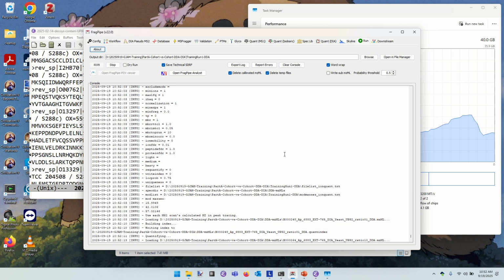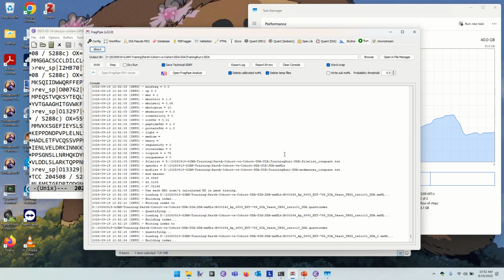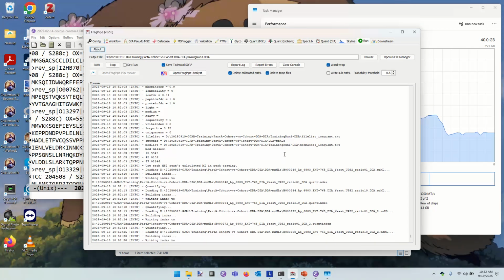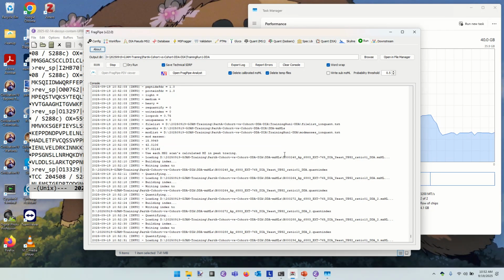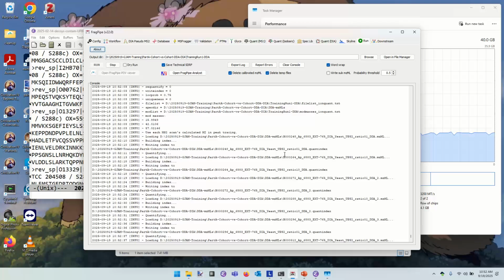I always think of things as kind of a big spreadsheet. I'm going to have a column for each of the 6 raw files, and each row is going to be some protein. It's okay if a protein has 3 reported intensities for the first 3 replicates of cohort 1, but no intensity reported in the other 3 because it's a different cohort. That's what we're looking for. Yeah, exactly. That's a biomarker for us.